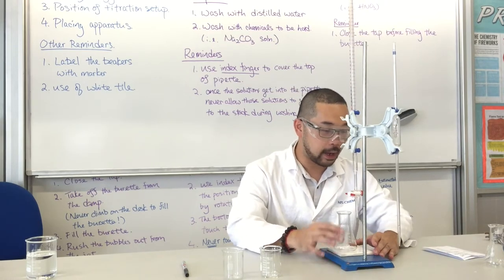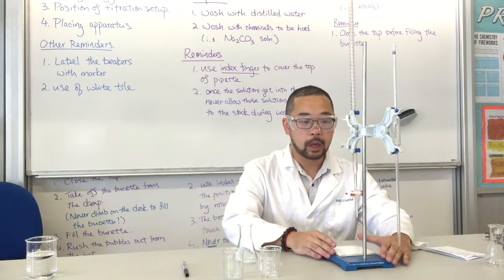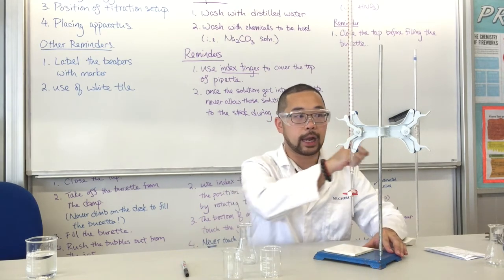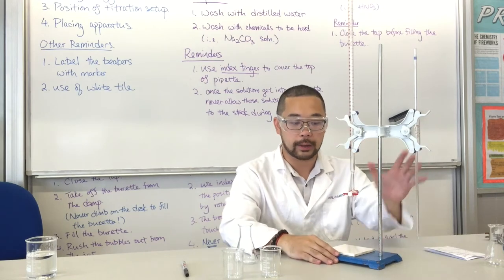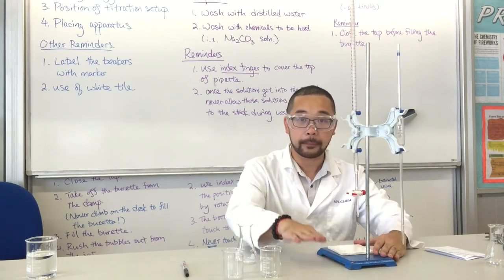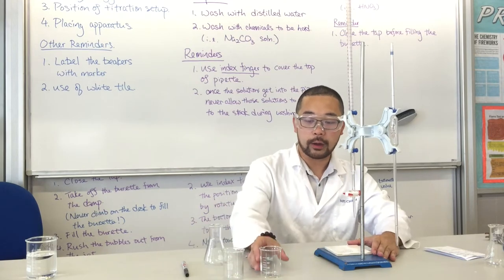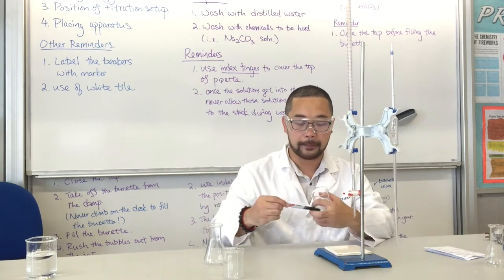And the last one is about placing the apparatus. When the burette and pipette are not being used, they should be clamped well on the stand and clamp, but not placed on the table. Other reminders for you would be the markers to label the apparatus.